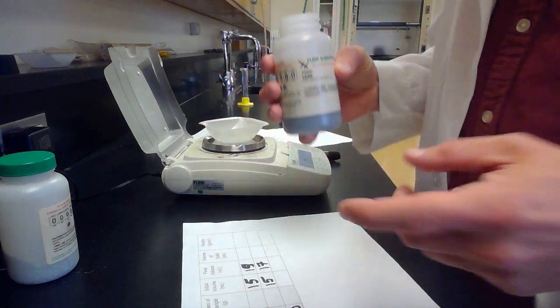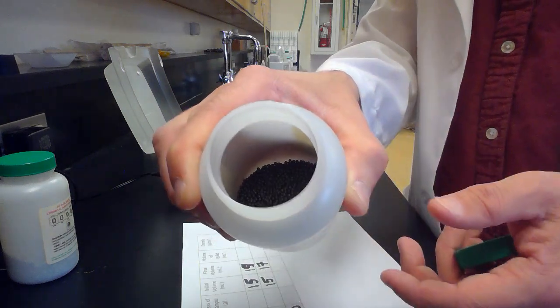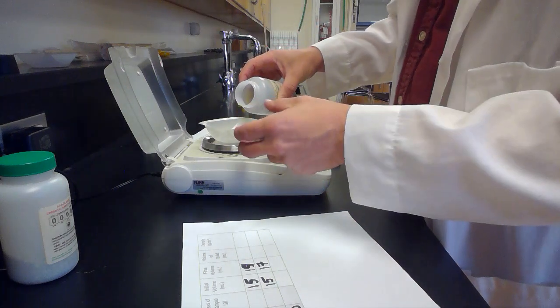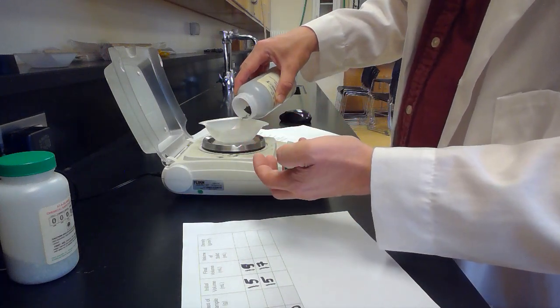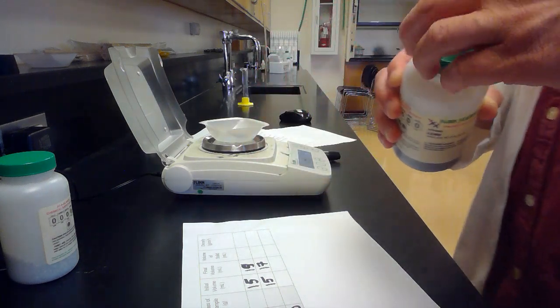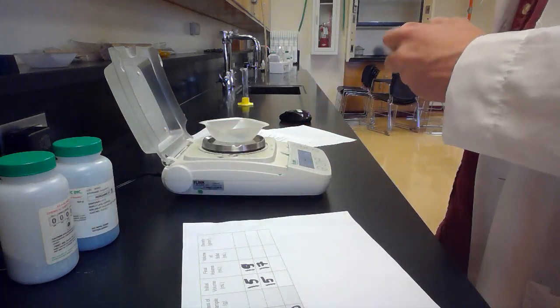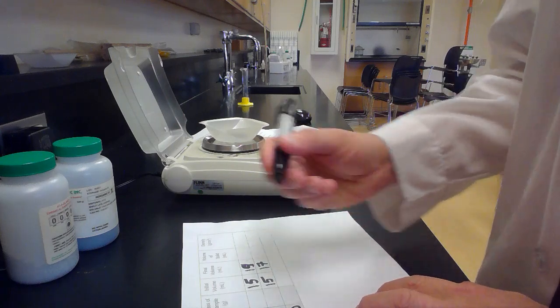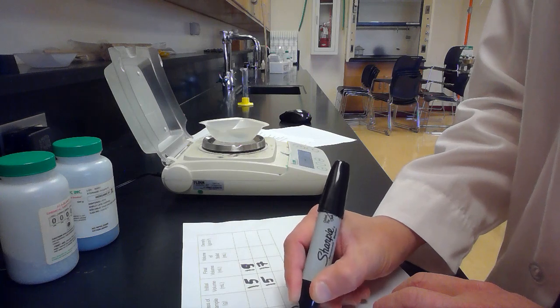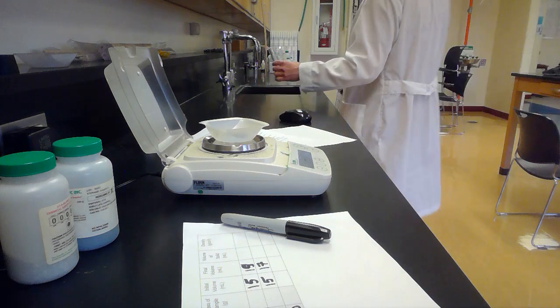Now the lead, if you're doing this lab in real life, these are tiny, tiny balls of lead. They run all over the place if you spill them. So please do not spill them. Probably that much is good. I don't know. Now this is way more than 8 grams, but that's okay. 43.56 grams. I'm going to put that under mass of beaker and sample. 43.56. Okay, now I'm going to get some water in my graduated cylinder.